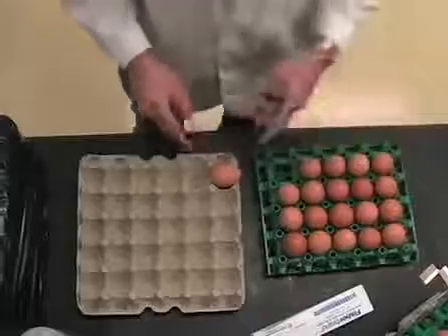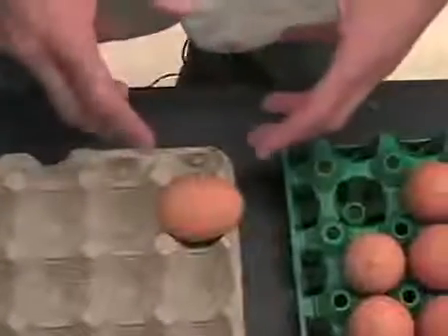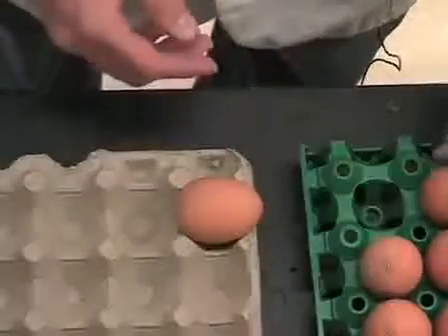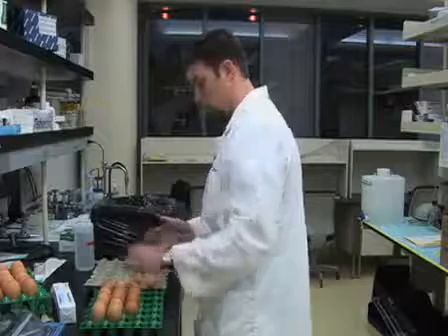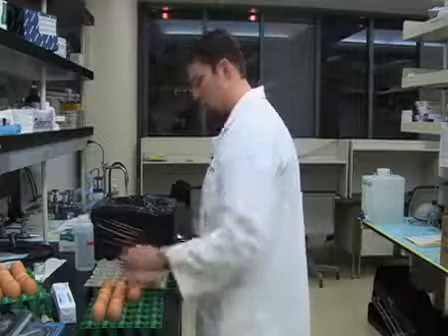Turning the egg does two things: first, our window's going to be right here, and secondly, the embryo needs to float to the top so we can make any type of manipulations. I'm going to set out a few eggs from the rack that was in the incubator to a cardboard egg holder — this is actually the piece that comes in the box when the eggs are delivered.